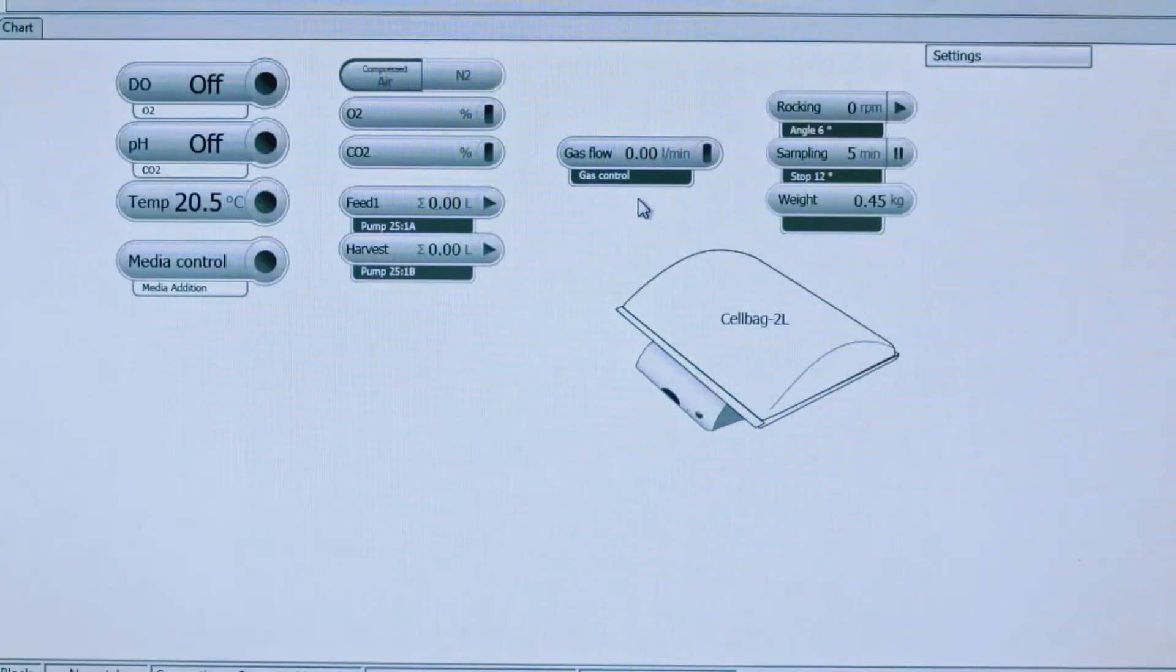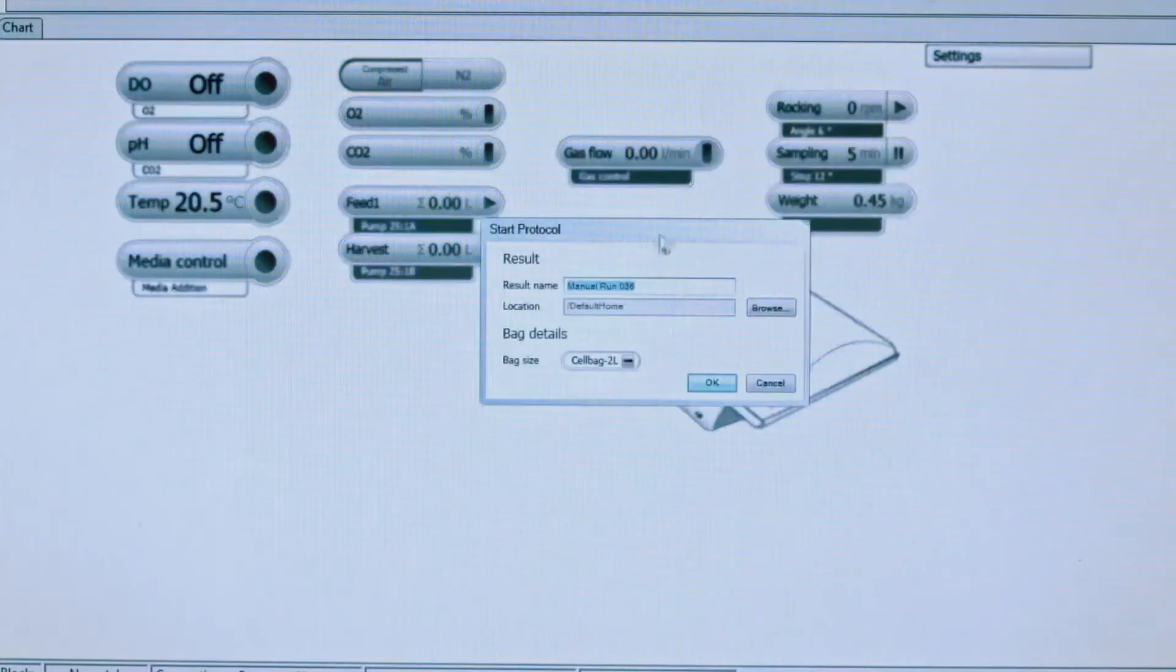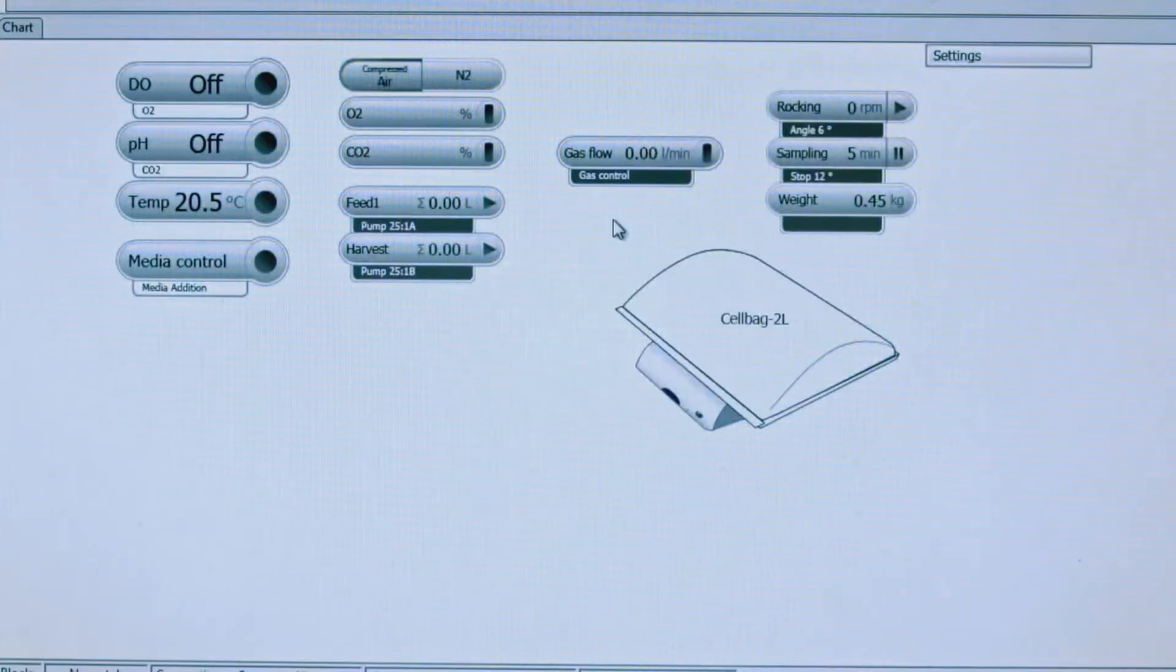To start a manual run within Unicorn, you can click on any of the buttons listed. We're going to click on gas flow and this will prompt you to name your run and define the bag size. We're just going to call this manual run and we have a 2 liter cell bag. Once you hit OK, the prompt that you want to start will turn on and you'll see that the gas flow will start. You can tell because it's green.